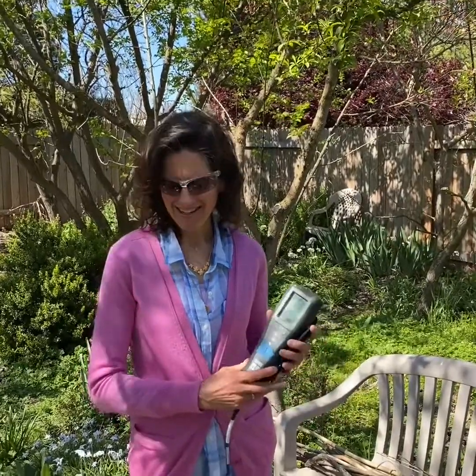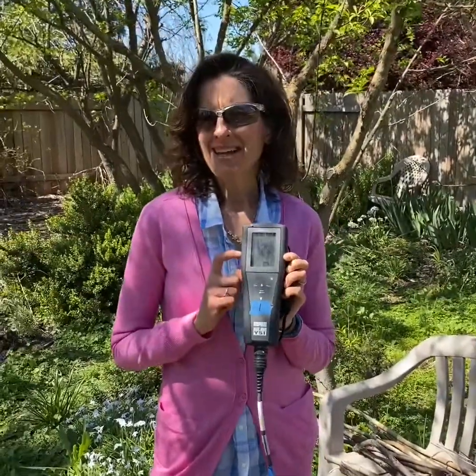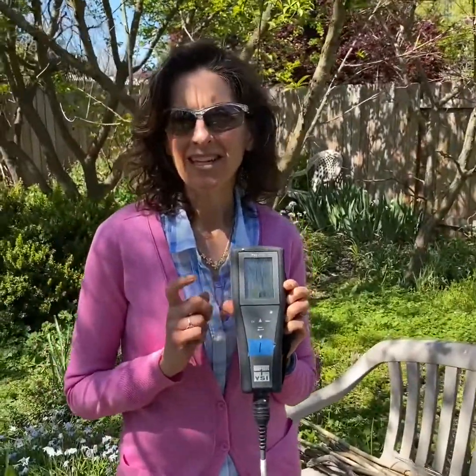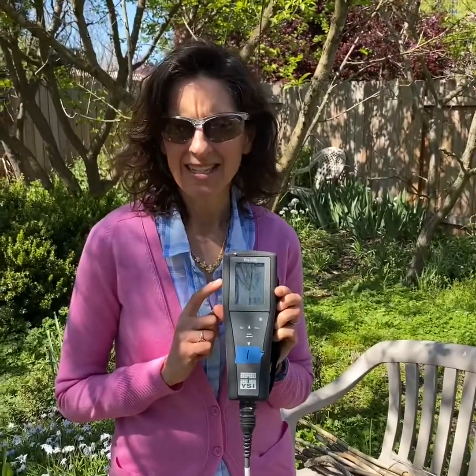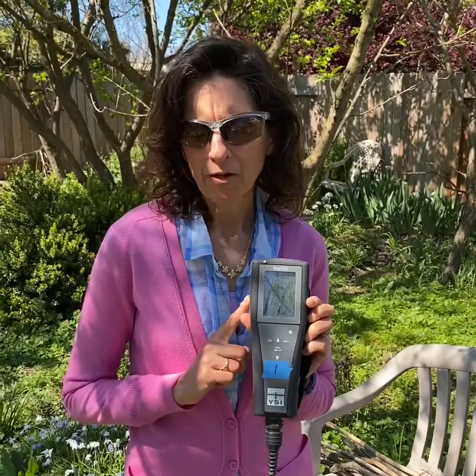It's Dr. I here, and in this video we are going to calibrate a YSI pH and EC meter. It does pH and also electrical conductivity and salinity. And we're first going to just do the pH meter though.